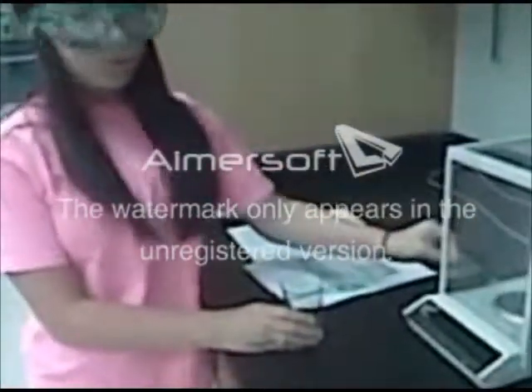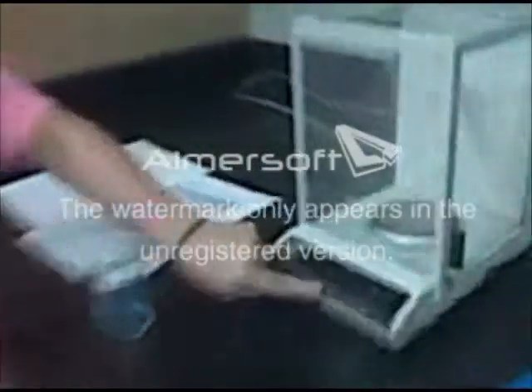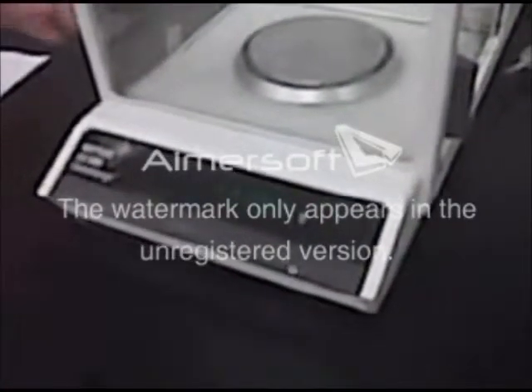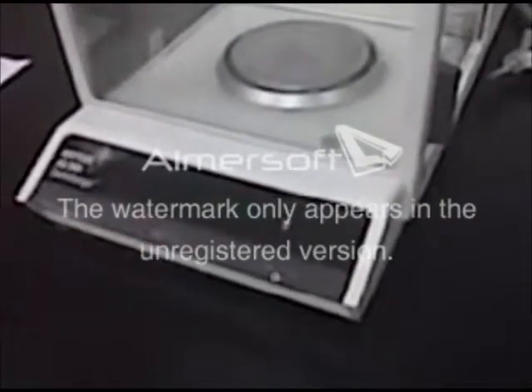In order for you to zero your balance, you're going to hit the tare button. And when you do that, that will automatically set your scale to zero. So if you ever start off and it's not at zero, just simply hit the tare button.